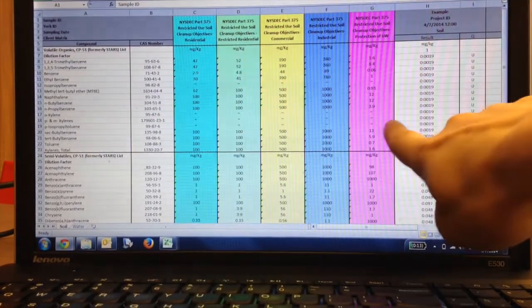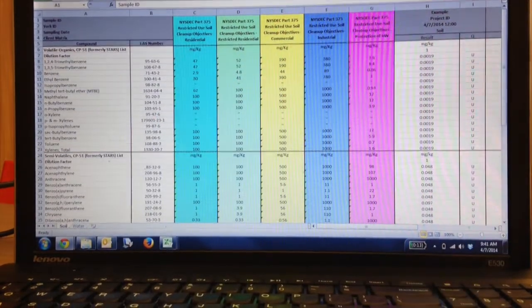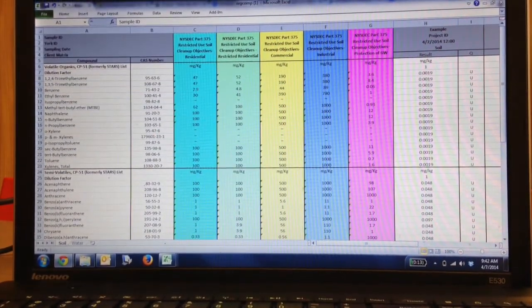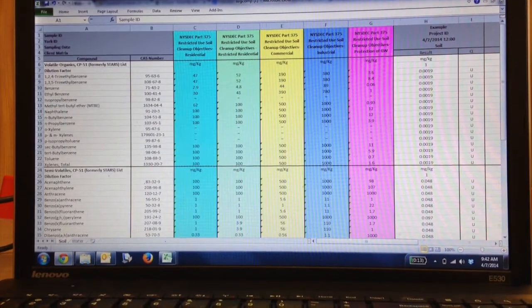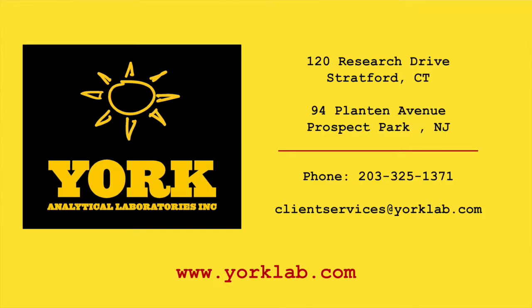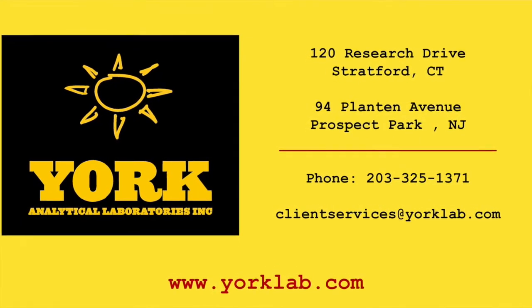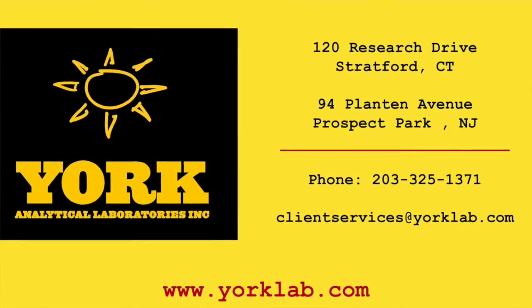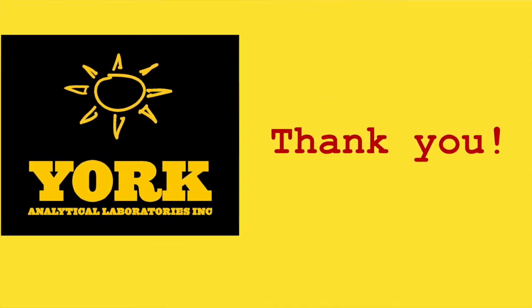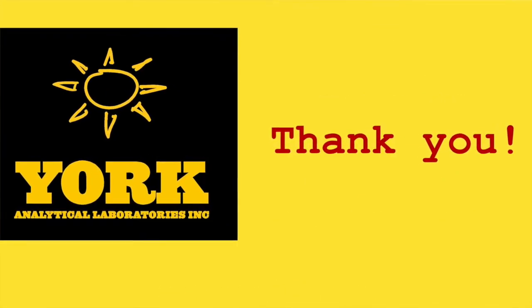We work from left to right, and because it's Excel, it only highlights in one color at a time, so it is important to go through and check across. We really do care about your feedback, so always feel free to call us or email us at clientservices@YorkLab.com and give us any feedback you have for our data port, our mobile site, or anything that we do. Thank you.